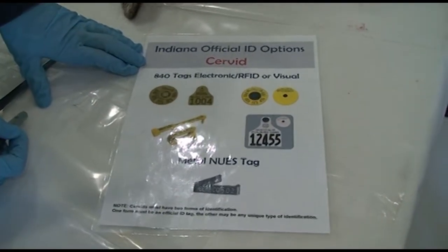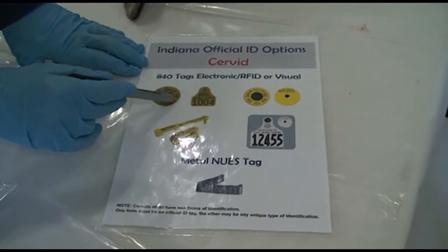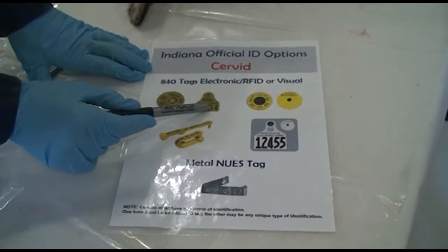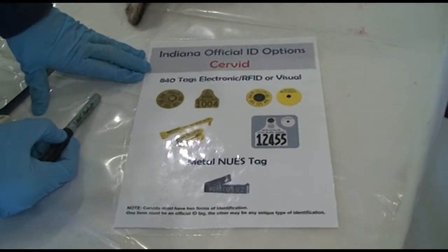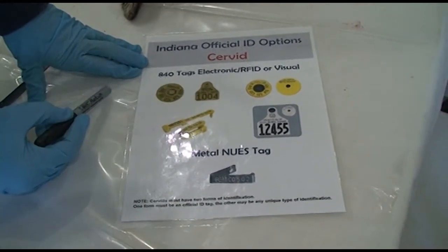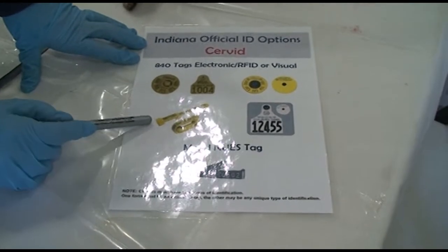Now the 840 tags can be in several different styles. They can be a button tag. They can be a button tag with a bangle. The 3 to 4 digit number that's on the bangle part of the tag is a management number. So the official ID is the 15-digit number on the button, and then the management ID can also be used for identification. This is a type of Shearwell tag.